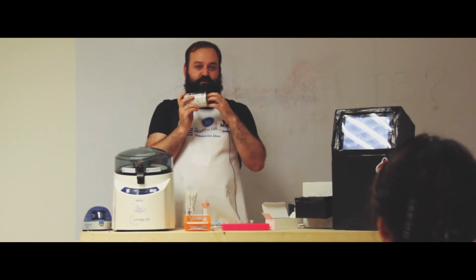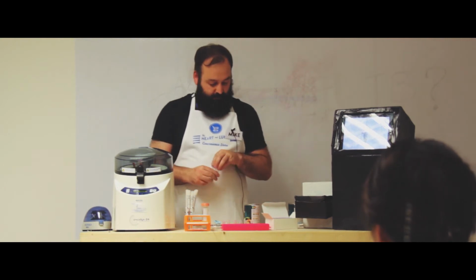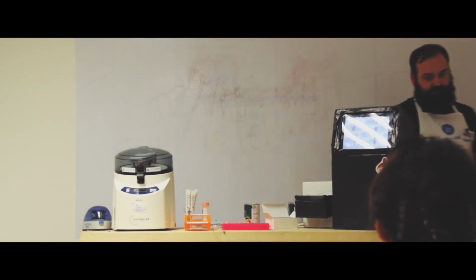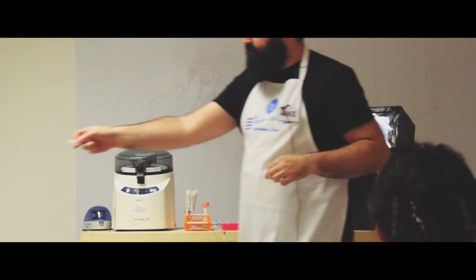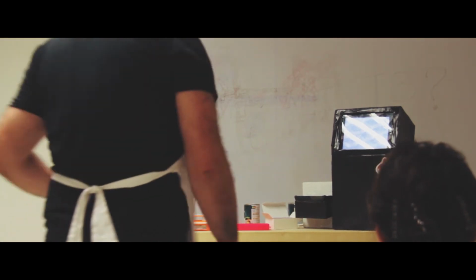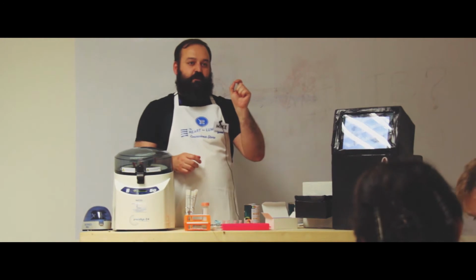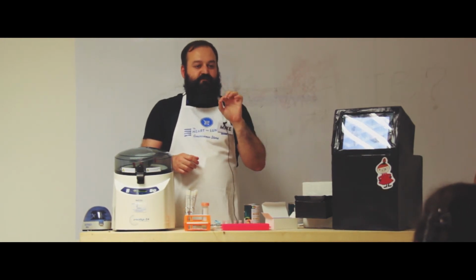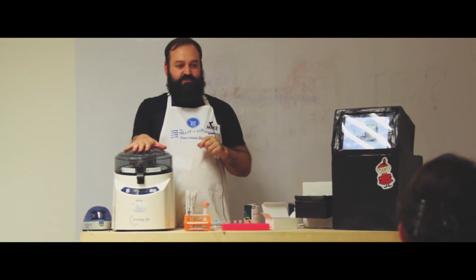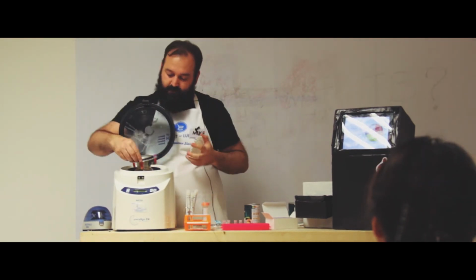So if you remember, I said these bacteria are really tough. In order to crack them open, I put the sample, which is either the swab or the lung brush, into one of these tubes. So I'm going to hand these out. There's one for you as well. Do you want to pass them round? They've got lots of little glass beads in them. There's a big one, which is there to mash up the sample, and then there's lots of very, very fine beads. When we shake that very fast in this machine, a bead beater, the beads all smash around and break up the sample.